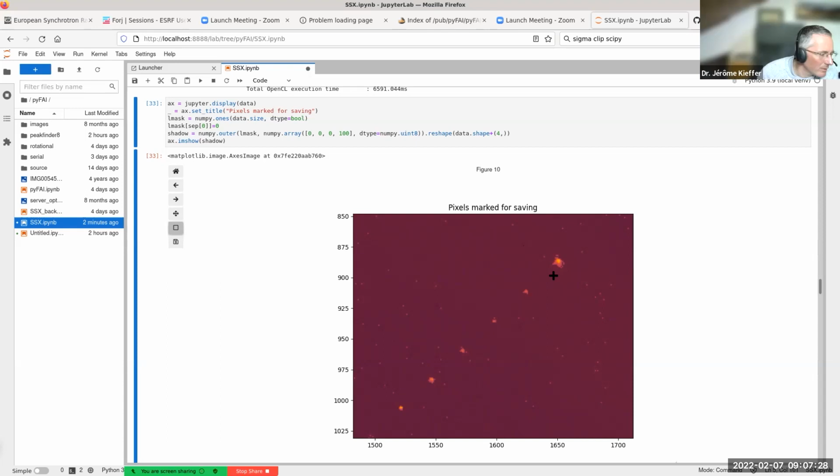The code was designed to run on an NVIDIA Tesla V100, which is pretty different from the GPU I have on my computer at home. So I'm making the demo on my computer at home. I could have made it on the computer at ESRF, but my colleagues had problems with connection this morning, so I considered it was safer to perform the demonstration at home.